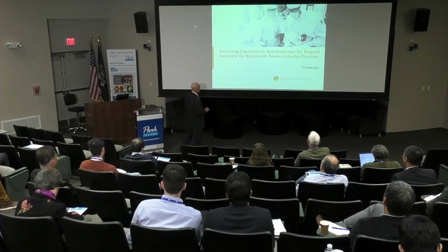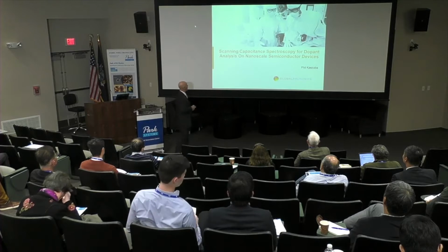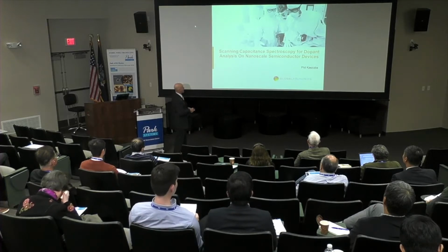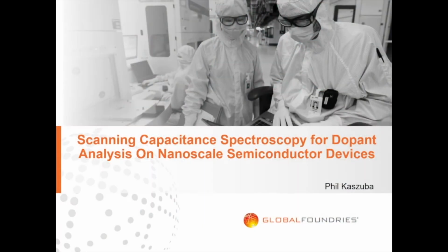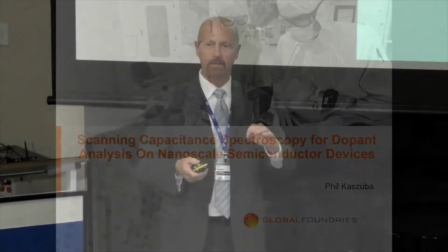Specifically, the analytical technique that I'm going to talk about is called scanning capacitance spectroscopy. It's a technique that is related very closely to scanning capacitance microscopy, but it takes it a step further and enables us to understand much more about devices, from the two-dimensional structures to the state-of-the-art three-dimensional FinFETs.